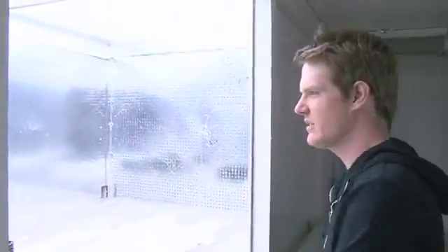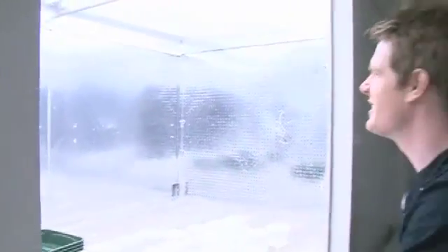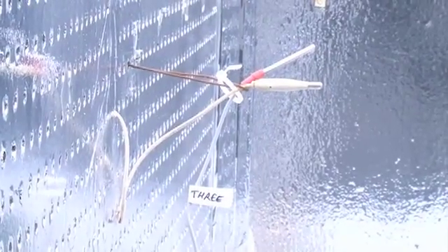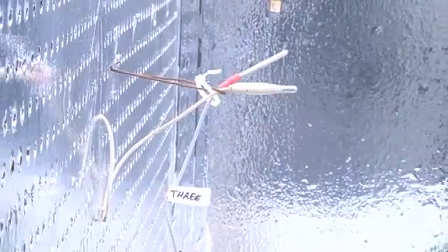This is a growth room. You can see it's bright because we need as much light as possible — plants need light as you know, and it's nice and reflective. That's a thermistor: a very accurate thermometer that records temperature, and you can plot exactly what temperature you've got in real time on a computer.